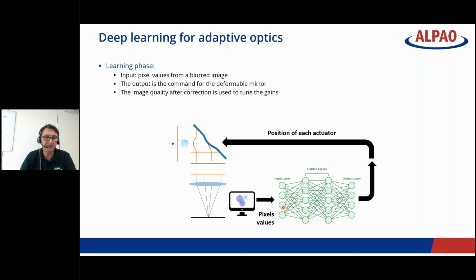You see that in this example, you only have 4 neurons. In real life, you may have a number of neurons equivalent to the number of pixels in your image. This can grow to a huge number of neurons, and this is why we have had great progress recently, just because the power of computers is large enough to handle a larger number of neurons and get some interesting results.